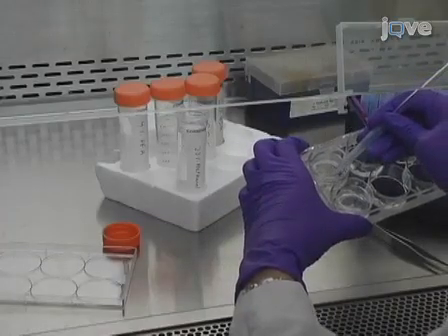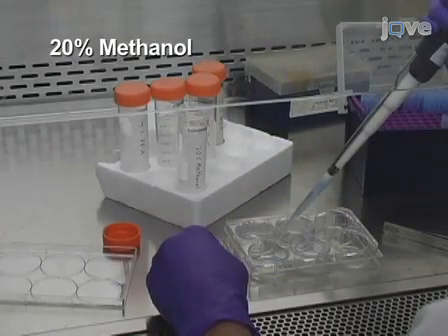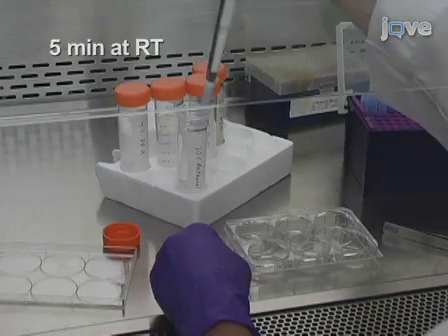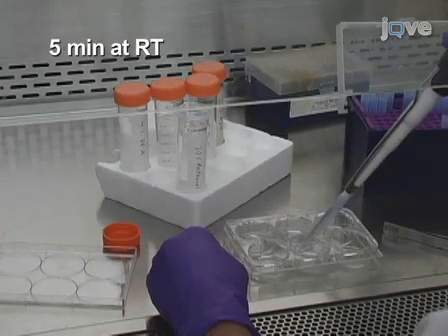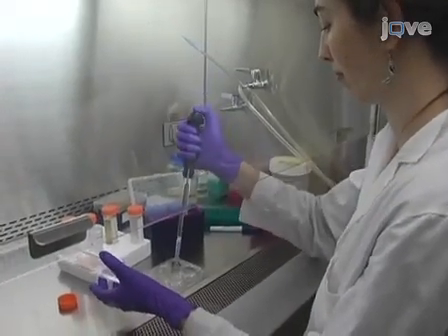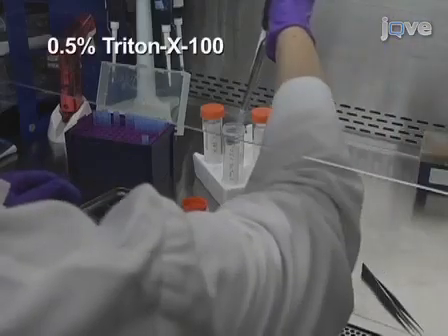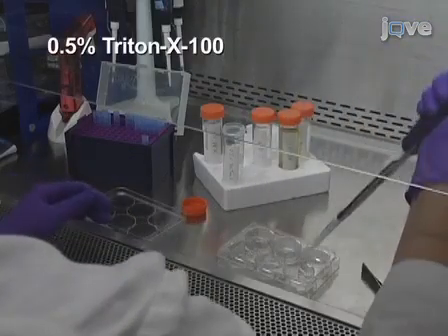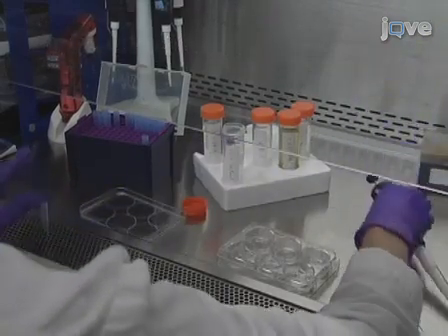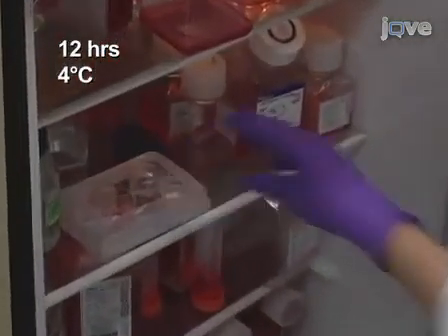Next, aspirate the PBS and pipette 1 ml of 20% ice-cold methanol in PBS underneath the insert and 1 ml above the insert. Incubate for 5 minutes at room temperature. Then, aspirate the 20% methanol from the well and wash the slice and well with PBS as before. Pipette 1 ml of 0.5% Triton X100 in PBS on top of the insert and another 1 ml underneath the insert. Incubate for a minimum of 12 hours at 4 degrees Celsius to permeabilize the slices.